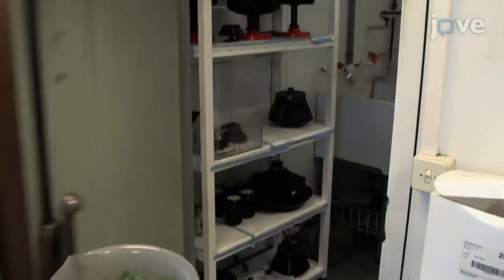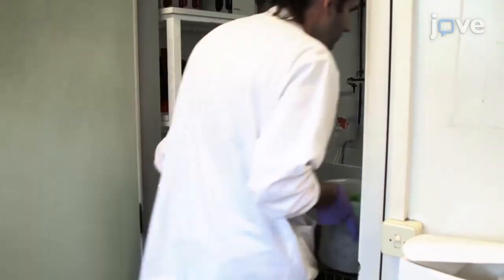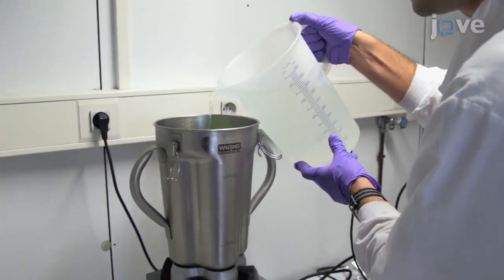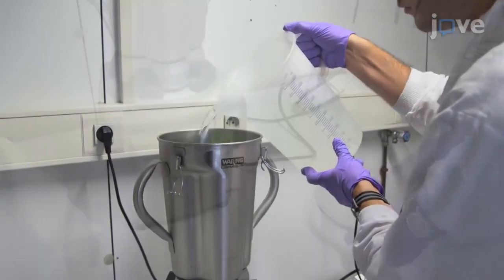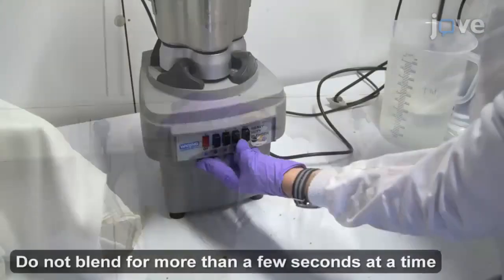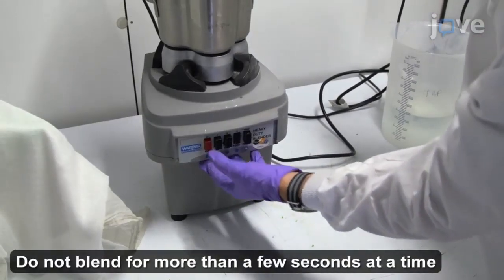Transfer the harvested leaves to a cold room. Place the leaves in a blender containing 2 liters of grinding buffer and homogenize them by blending at high speed three times for a duration of two seconds each time.